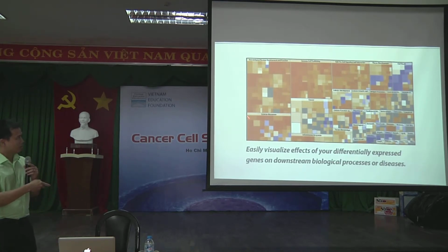Based on all of the information available in PubMed, IPA will classify them into pathway and biological process. And they will use them to screen for your data. And after that they display them as a heat map right here. So in this heat map, orange color represents upregulation. A blue color represents downregulation. A white or gray, just minor change.